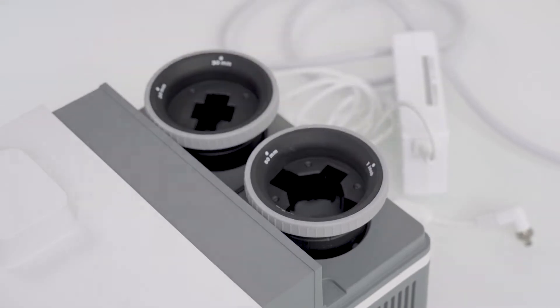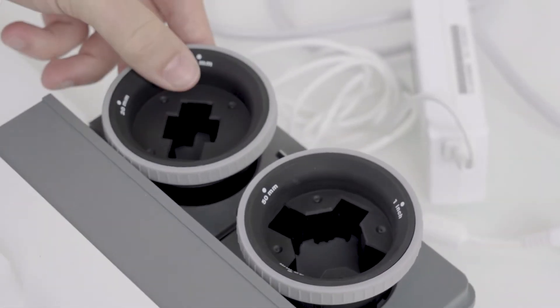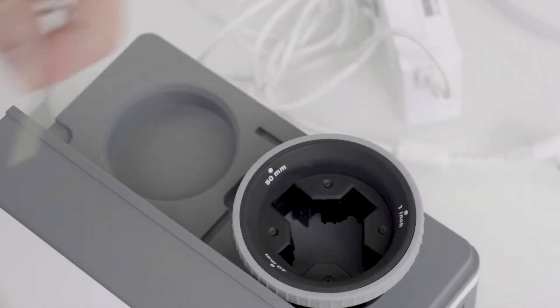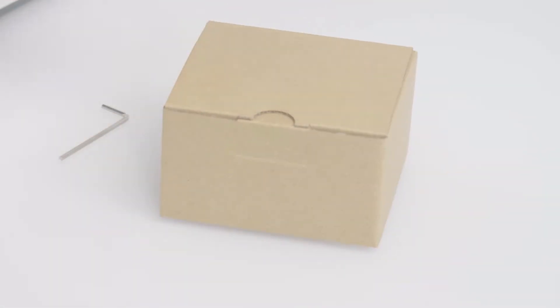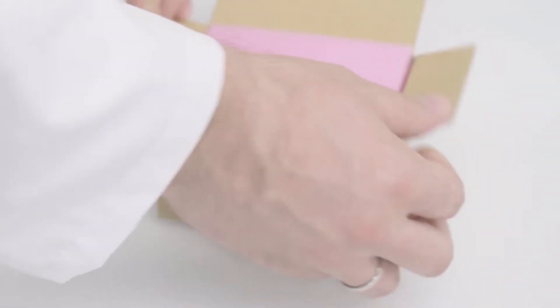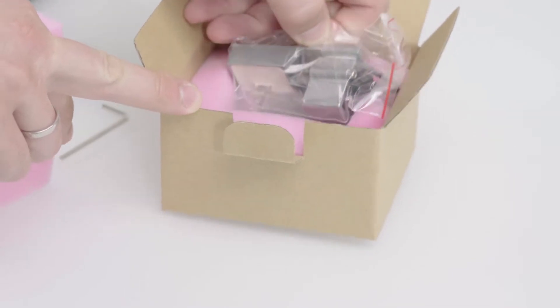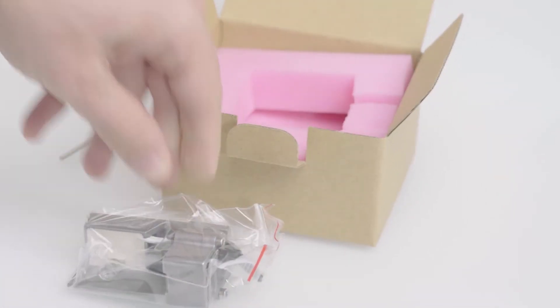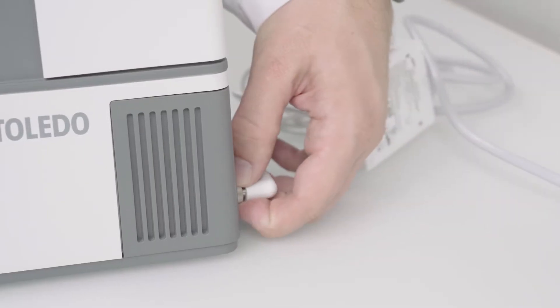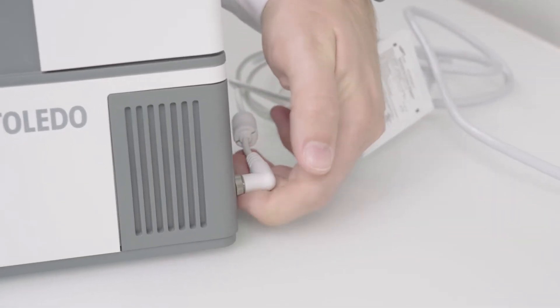Remove the back cover and take the allen wrench from its position. Unplug the power cable and tilt the instrument on its right side.